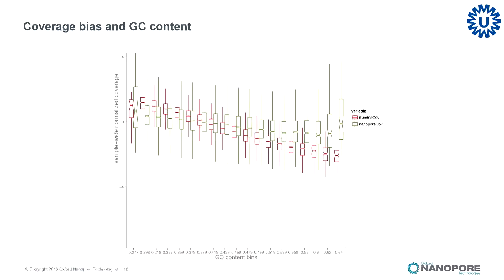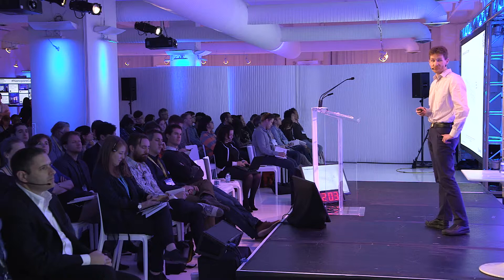We first looked at some sequencing specs of these data, like read-length profiles, but I think very interesting is this GC bias plot — the coverage distribution affected by GC bias. Here we compared Illumina data for this sample to the nanopore data of the same sample, and you can see that there is much less bias in general for high-GC or low-GC regions when you compare nanopore to Illumina.